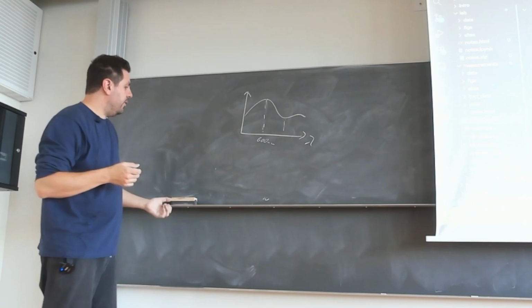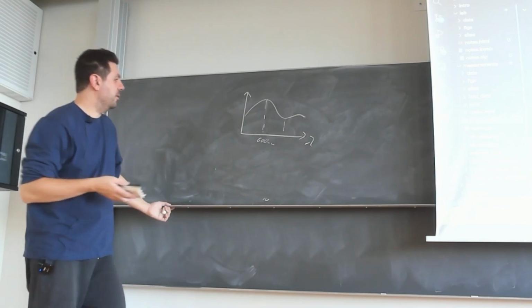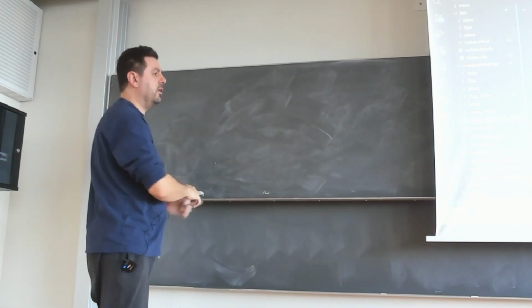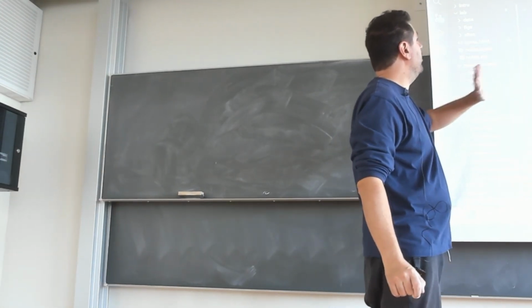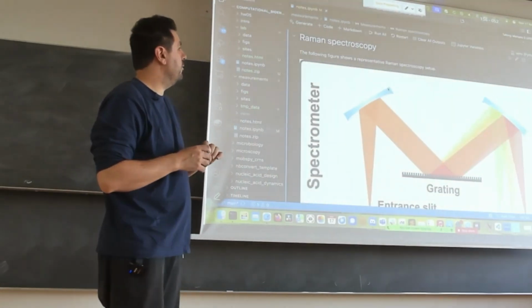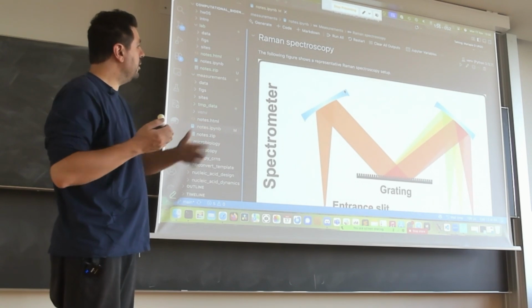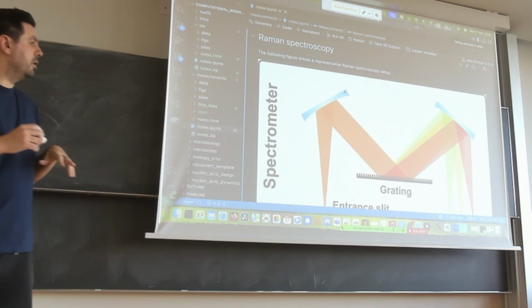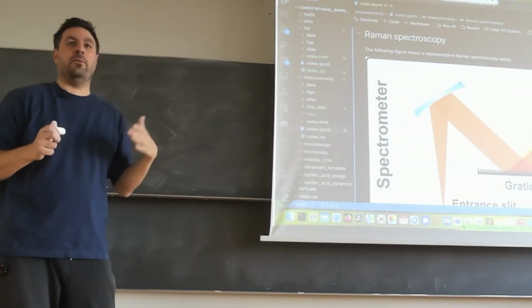And you can use now another principle that is not based on absorbance, but on a little bit more complicated thing. And this is actually useful to obtain something that is called a Raman spectrum. I will not go here into the physics, not for the reason that it's too complicated. You can actually check that out. The Wikipedia article is quite nice about this. But just because we actually don't care what is being done.